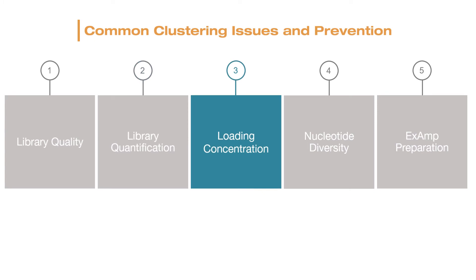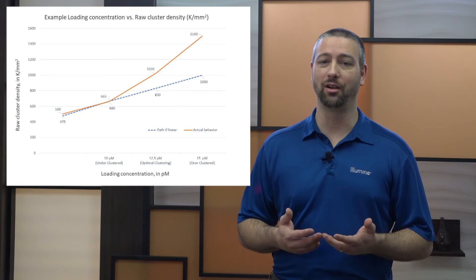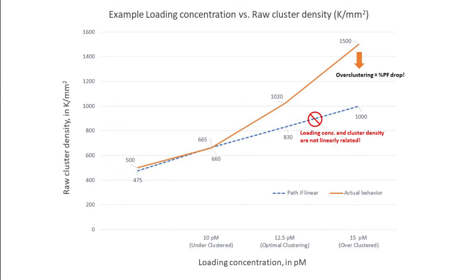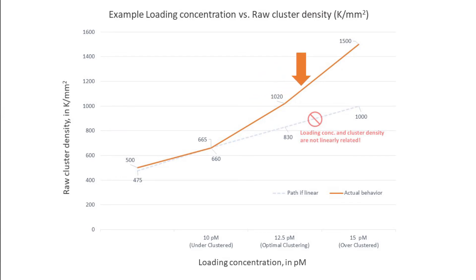Now let's examine common issues loading concentration can cause. The loading concentration is the final concentration of a library loaded onto an instrument for sequencing. Recommended loading concentrations can be found in the denature and dilute guide or the system guide. It's important to adjust loading concentrations in small increments, because the relationship between loading concentration and cluster density is non-linear, as seen in this chart of example data for the MiSeq V2 chemistry. Assuming a linear relationship when adjusting loading concentration can lead to over-clustering and a drop in percent clusters passing filter. Achieving optimal cluster density likely requires a small empirical adjustment to determine optimum loading concentration.